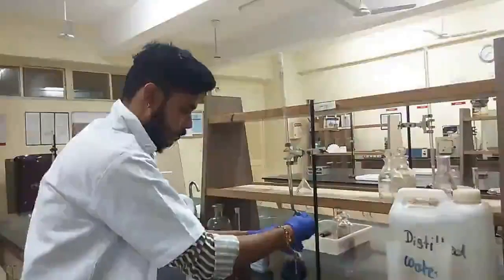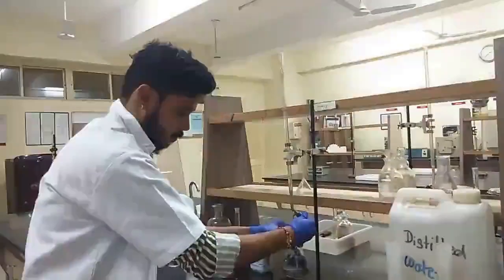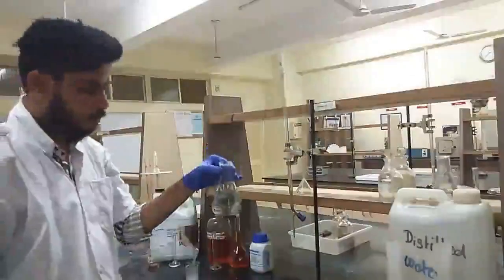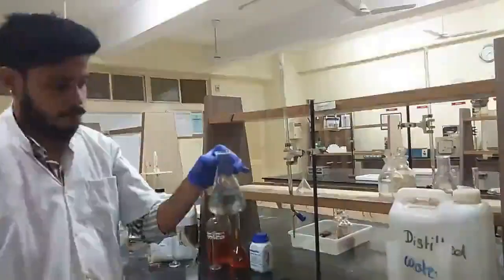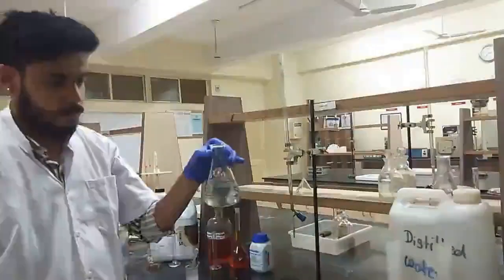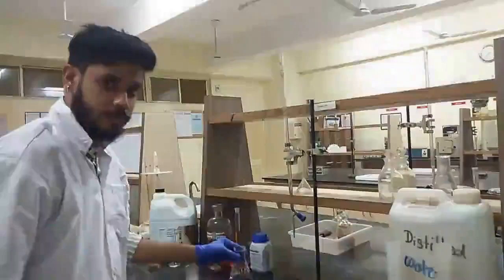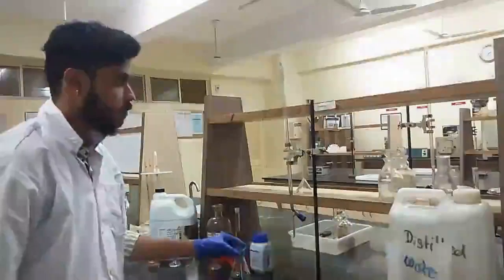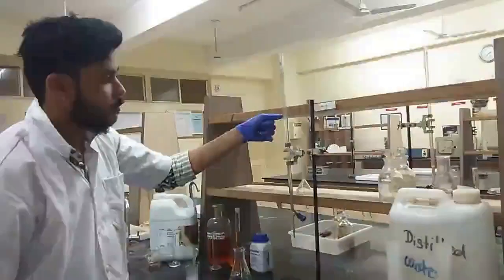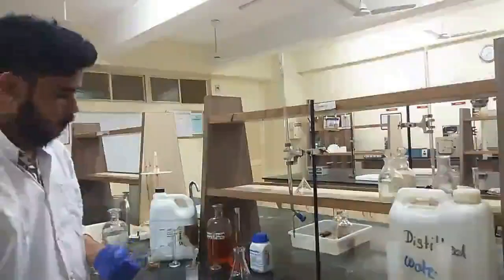The titration should be continued till the colorless sample is obtained. Yeah, the end point of this sample is colorless. So you can see the blue color has changed to the final color, which is colorless. Now we'll be seeing the reading, and the reading that is obtained is 9.3 ml. We'll be noting down this reading for our further calculation of finding out the normality.